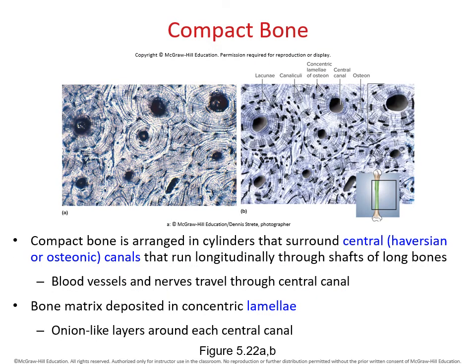Now, speaking of bone, compact bone is actually also an example of connective tissue. As you can see, compact bone, when you look at it under the microscope, looks like little tree trunks that have been sawed in half. And the individual circular structures, let me just circle in for you. These are called osteons. These are the individual units of the compact bone.